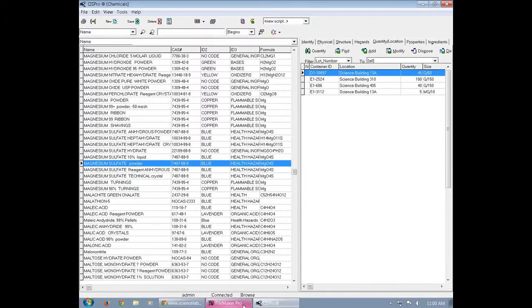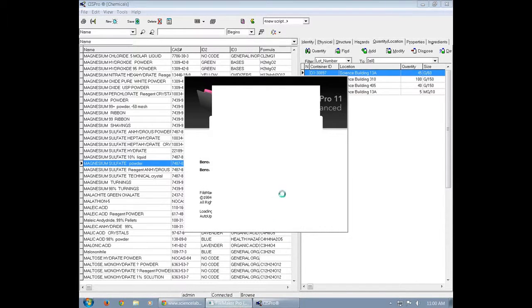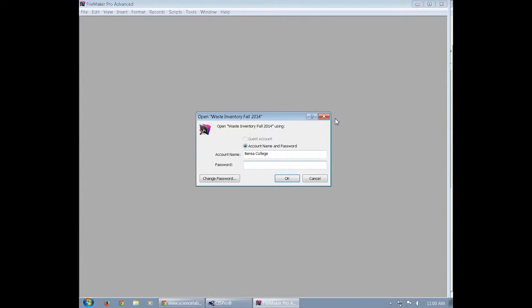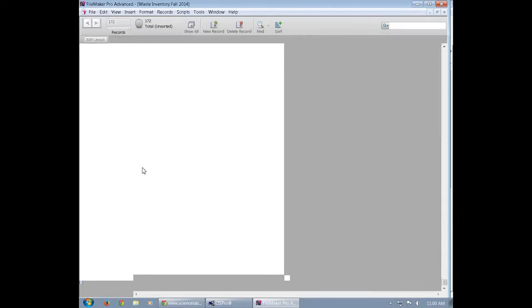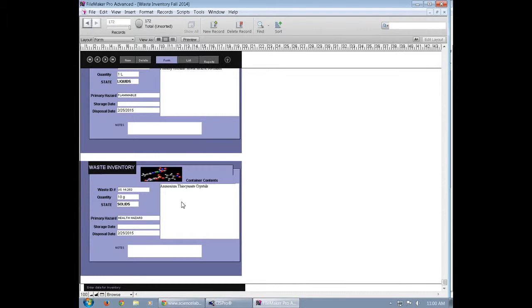Now that you've done that, you need to go to FileMaker. In FileMaker you're going to create a waste ID number. So once you get there, you're going to log in. And after you log in, you're going to click new record. New record will create a new entry.